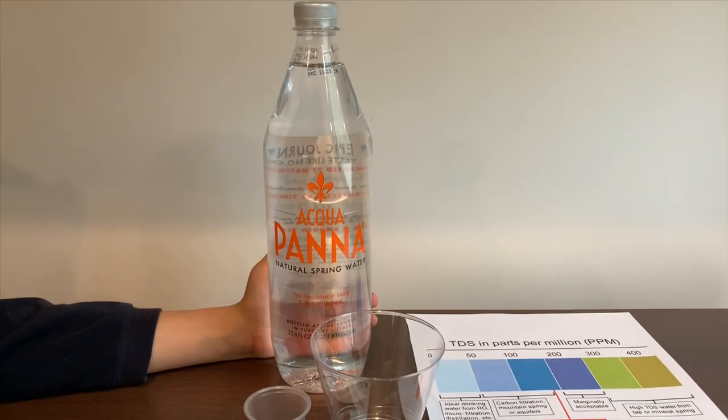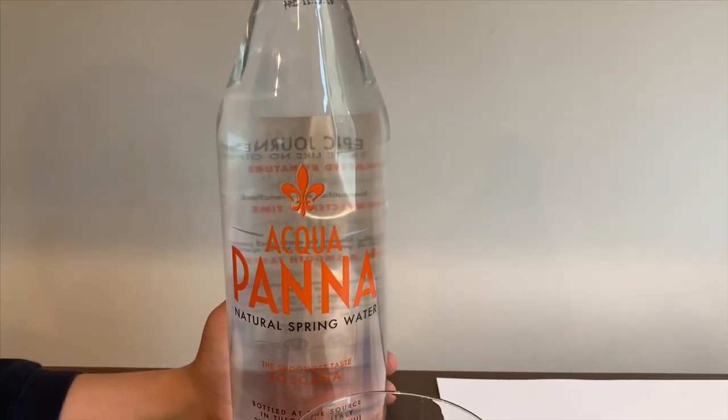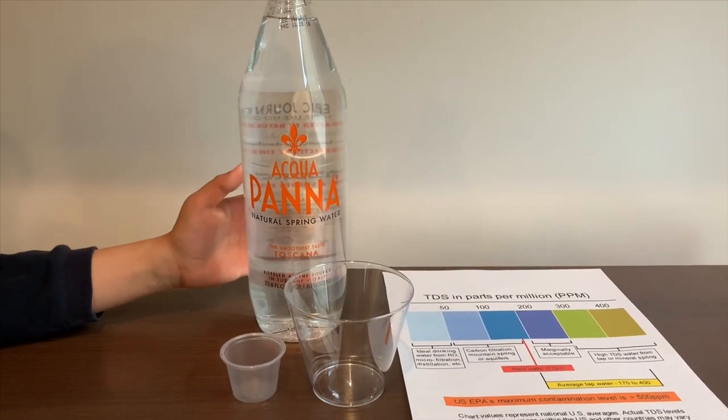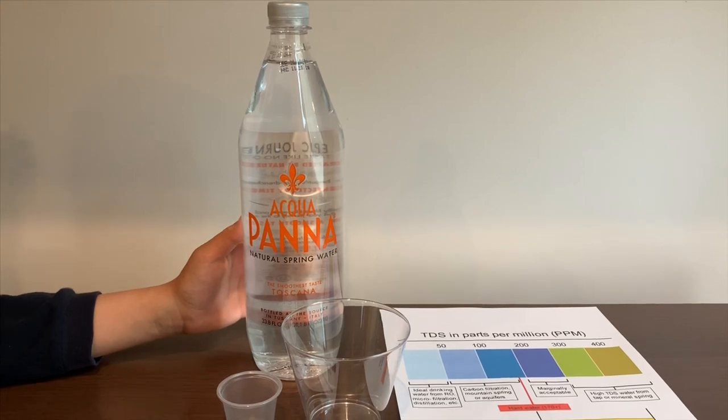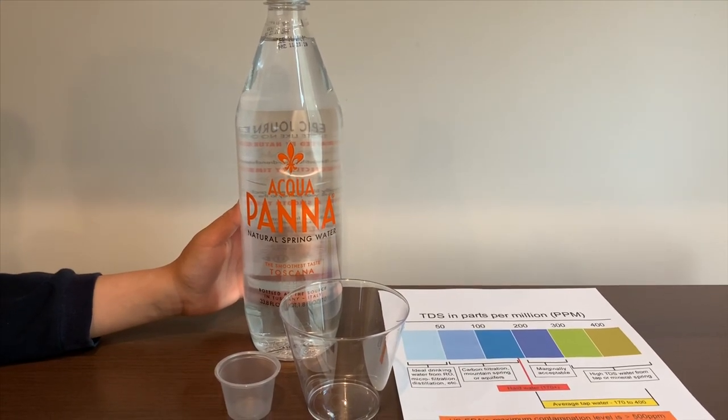This is Aqua Panna natural spring water. It's sourced from Italy and it costs $2.49. Remember we tested the glass version of this? Its TDS was 121 and its pH was 8. Let's see how this compares.